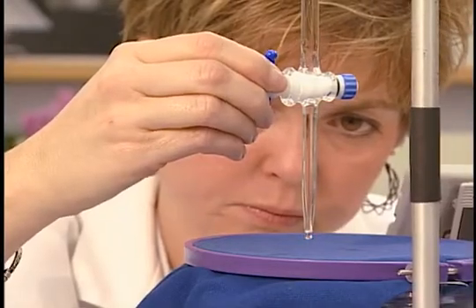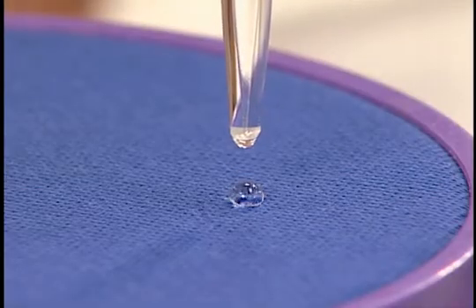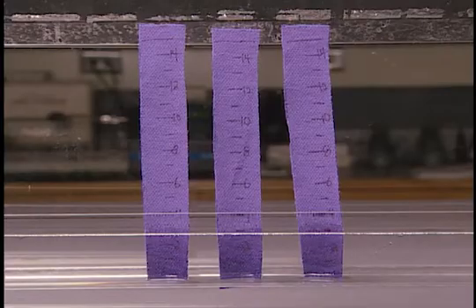The moisture management test methods that have been covered so far have dealt with the amount, distances, and time of water movement.